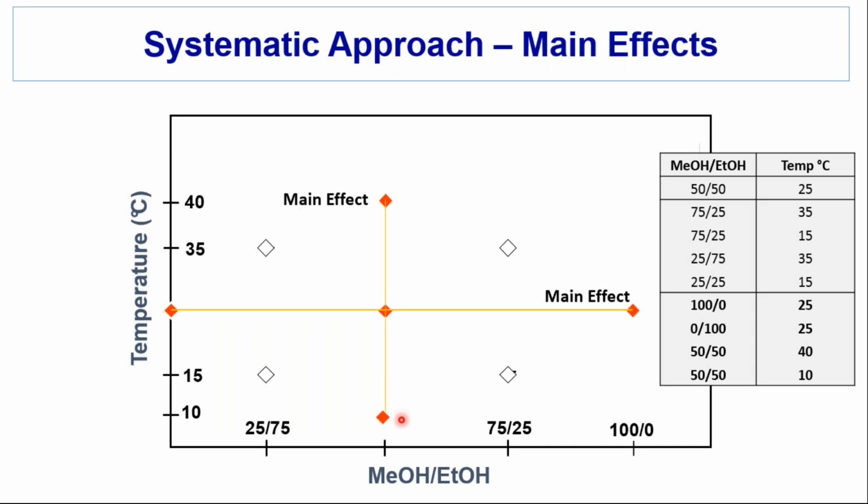Statisticians refer to this as main effect. It means everything's held constant. We're just looking at the behavior of one parameter change with everything being held constant. So if you want to, it's statistically defensible because statisticians have a name for it. So you could still at least run these experiments, and this is still a systematic approach. You don't know about the interaction, but you do know what the bulk effects are.